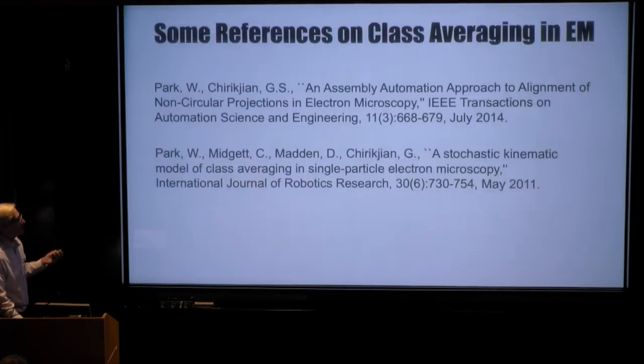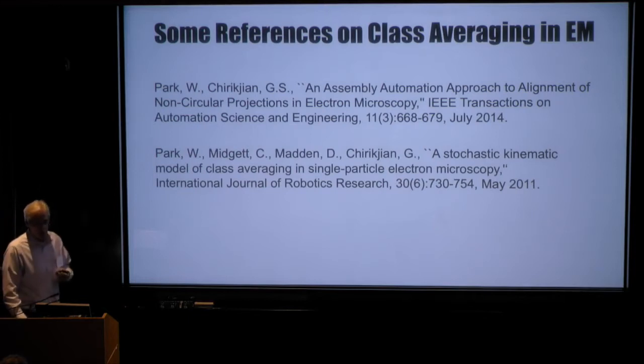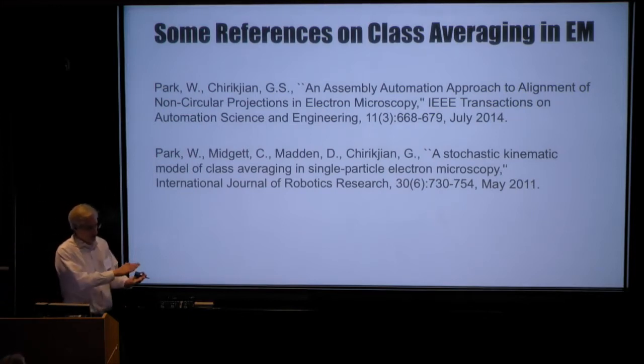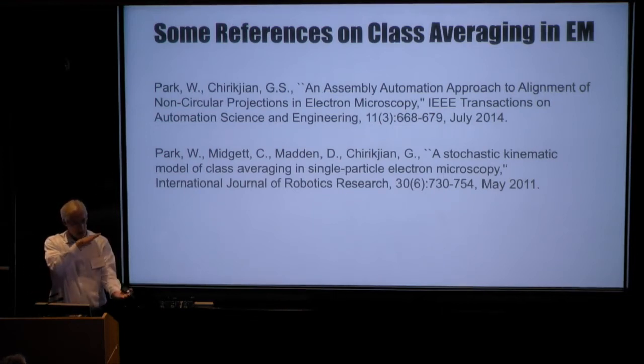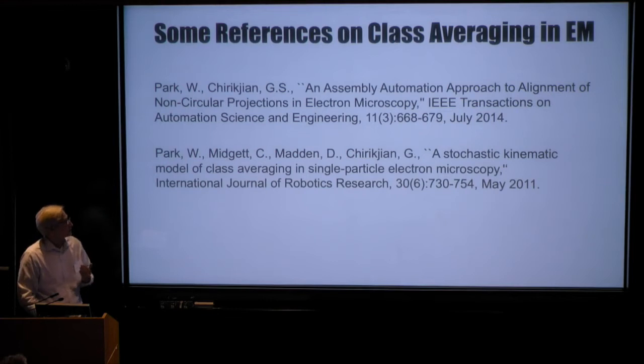And the take that we had on this was that when doing class averaging, you're trading off noise for blurriness in a sense, by stacking images and having the noise disappear. Because the images cannot be stacked exactly, that results in a motional blurring of the image relative to the underlying thing that you want to attain.